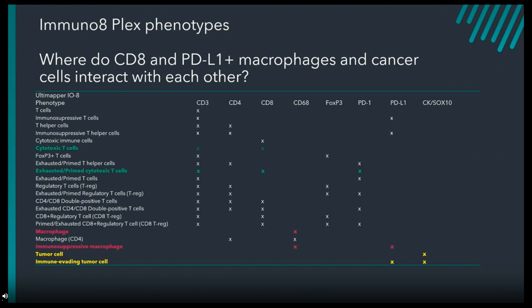What I want to focus on today is the cytotoxic T cells, and when they are becoming either exhausted or primed with the expression of PD-1, which is available in this kit, and macrophages and tumor cells that are expressing PD-L1.